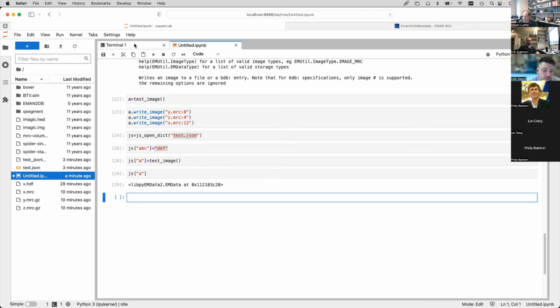If you made HDF files with large numbers of images, not large images, but if you made an HDF file that had 10,000 images in it, it became impossibly slow. The guys who wrote HDF5 had never really thought about the idea that people would want to not just put big volumes in, but they would want to put thousands of images in a single file, and they had not designed some aspects of the header with that in mind. So we complained to the HDF guys, and over the next 2 or 3 years, they managed to adapt things. So now HDF actually does support large numbers of images very effectively.